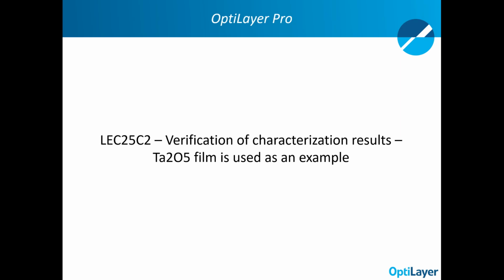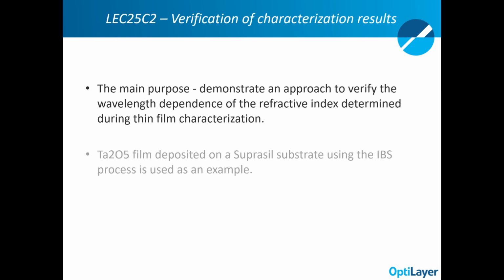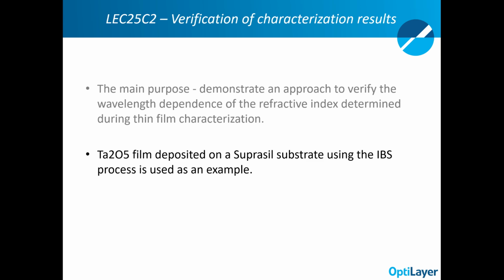The main purpose of this example is to demonstrate an approach to verify the wavelength dependence of the refractive index determined during thin film characterization. A Ta2O5 film deposited on a Suprasil substrate using the IBS process is used as an example.